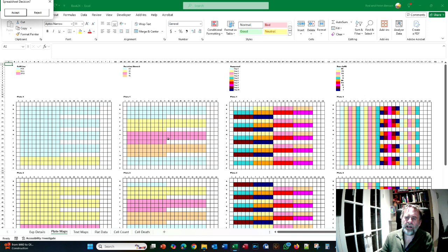And by the way, you can do that, because remember, with an HCA experiment, the way you would do this is you would work backwards. So you'd put a drug, say, on here first, then 24 hours later put the next drug on, 24 hours later put the next drug on, and so on and so forth, and then fix it all at 96 hours. So you can build time courses into a plate like we've done here.